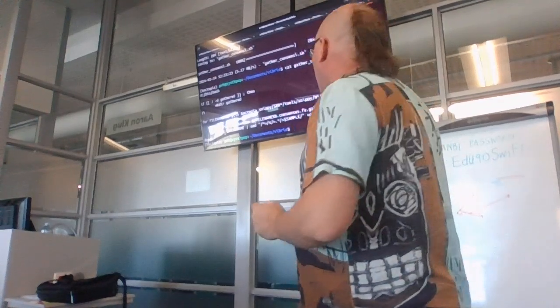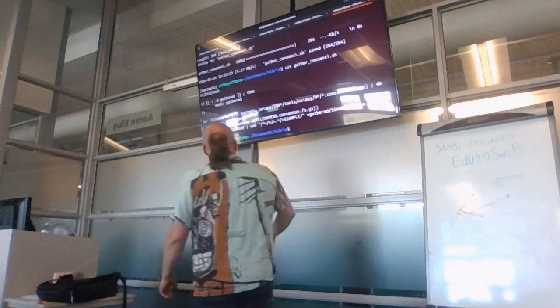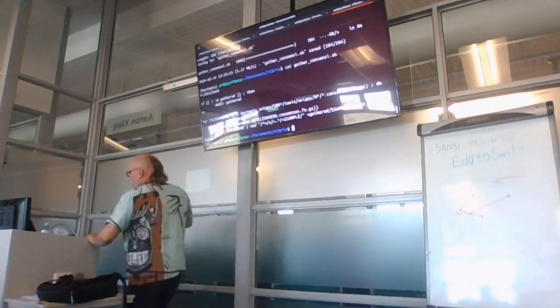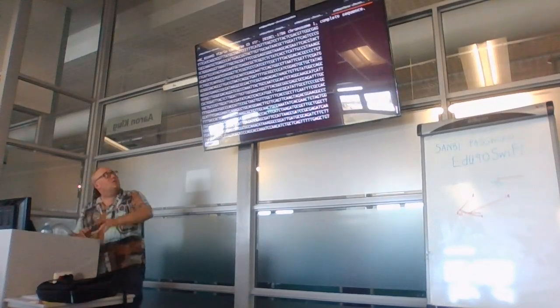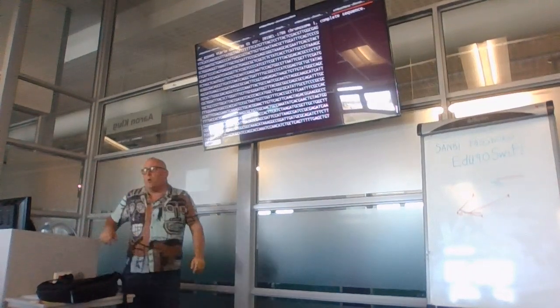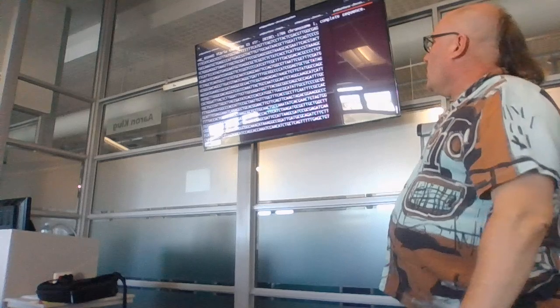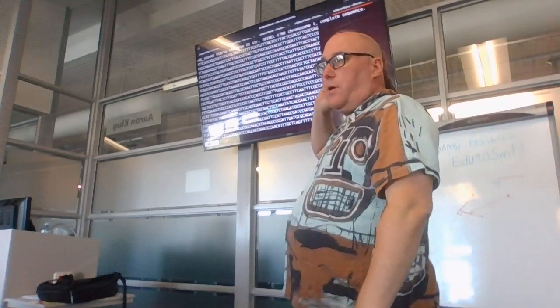But there was one problem that I noticed: the header line was wrong. It has the same name as the consensus sequence that I used, okay?